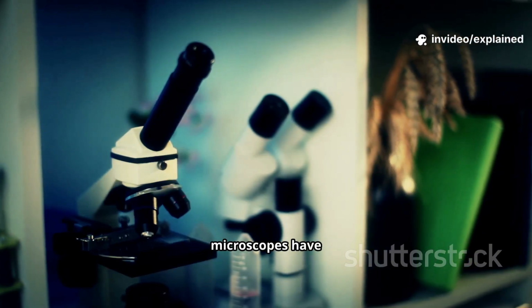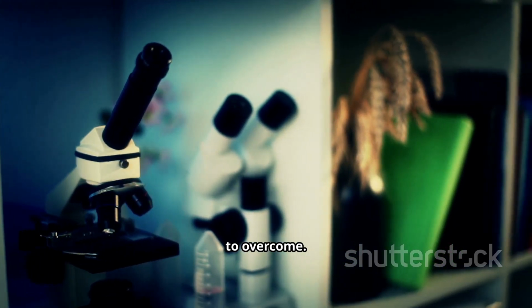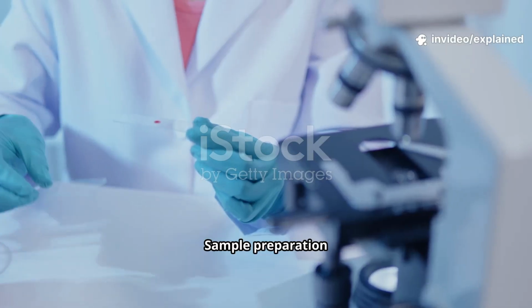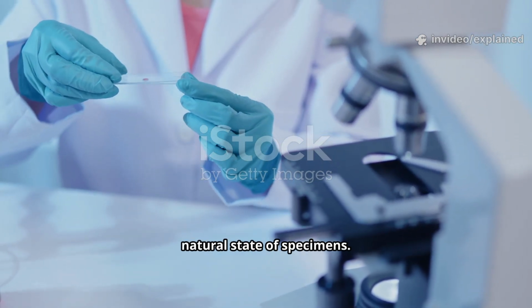Despite their power, microscopes have limitations that scientists are constantly working to overcome. High-energy electron beams can damage delicate biological specimens during imaging. Sample preparation can sometimes create artifacts that don't represent the natural state of specimens.